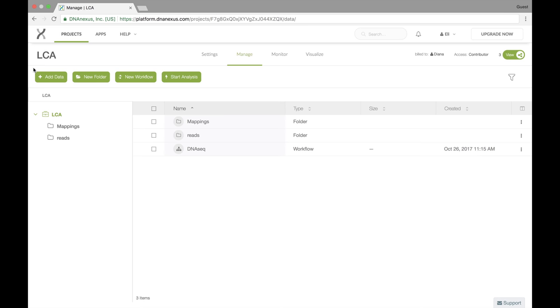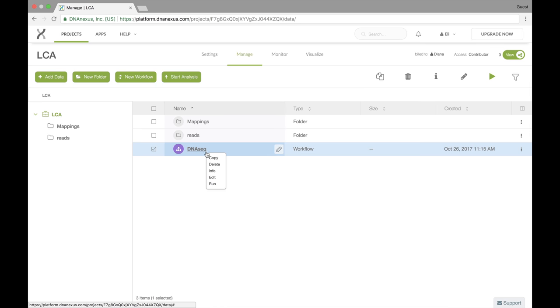However, we can still go back and edit our template if we miss anything. There are two options. You can either right click on the workflow itself and select edit.